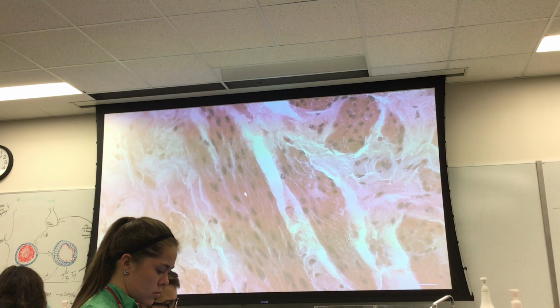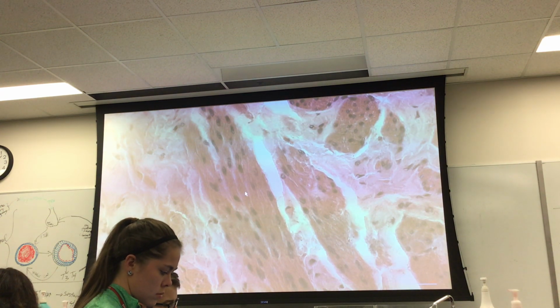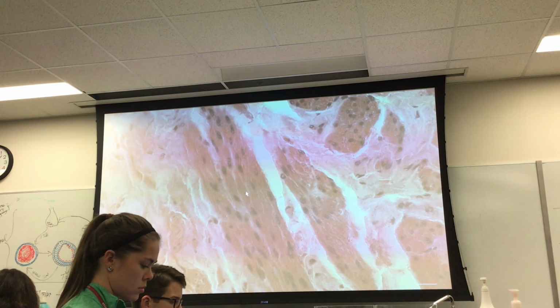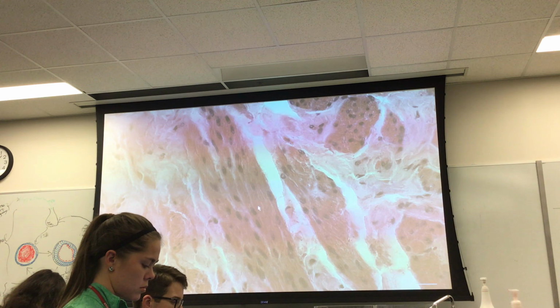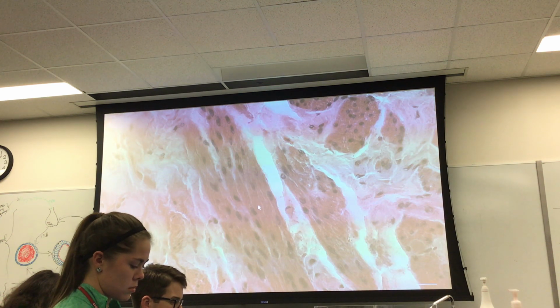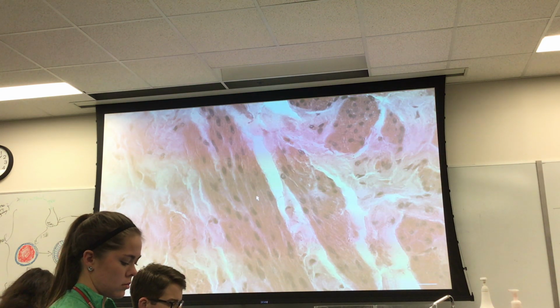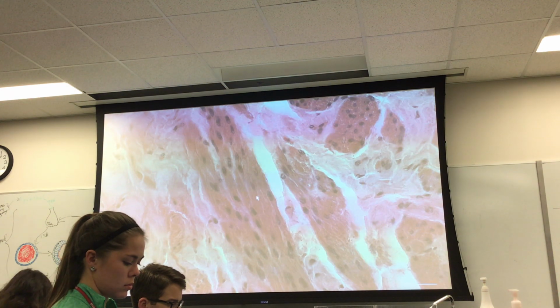Muscle always stains denser than connective tissue. And why is that? Because muscle cells, even smooth muscle, are made of actin and myosin. Those are dense proteins, versus connective tissue, which is collagen, not the same. So muscle always stains deeper. Okay.